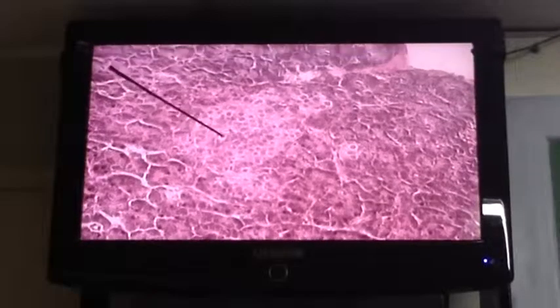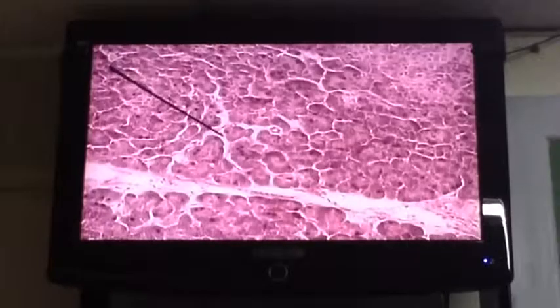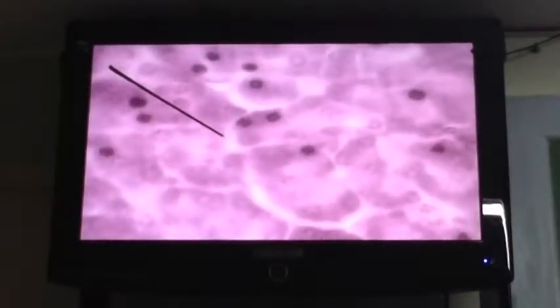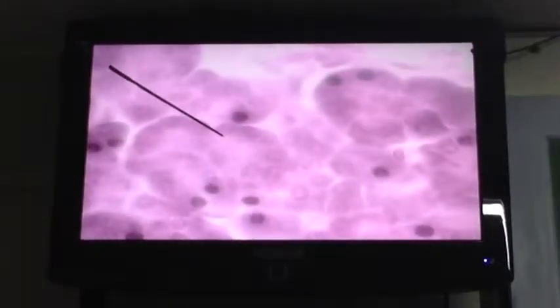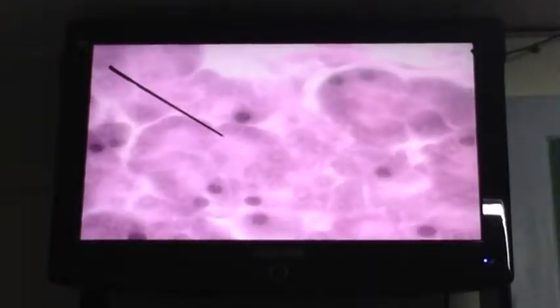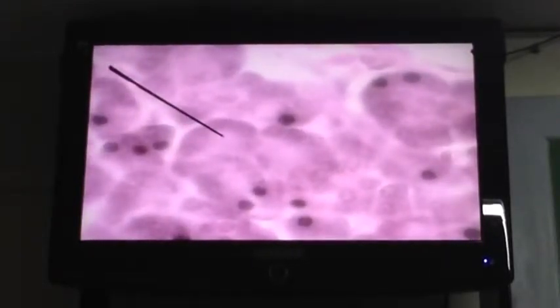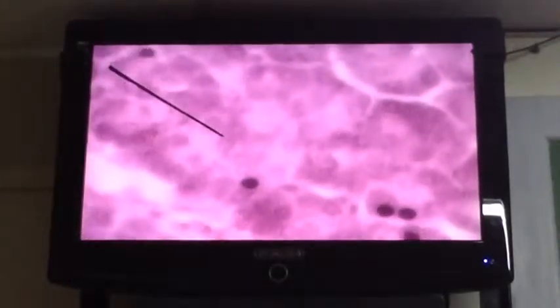Okay, a very good example of the islet of Langerhans. So we'll go back to this in the endocrine next semester. Our focus will be on the pancreatic acini first. So let's do a higher magnification, high power. The pancreatic acini, notice the cells that line them are pyramidal. They have a highly basophilic base and a paler center.